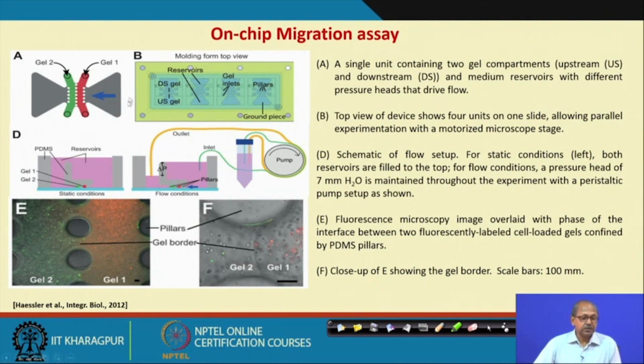The construction of the fluidic setup is that there are two reservoirs, and these are the wedge-structured pillars; groups of pillars 1, 2, 3 make two channels. You give collagen gel, and this is collagen gel with embedded cells. Here the matrix gel is given in different percentages, by which the porosity will be different and the interstitial fluid flow will be different to sense the cancer cells.